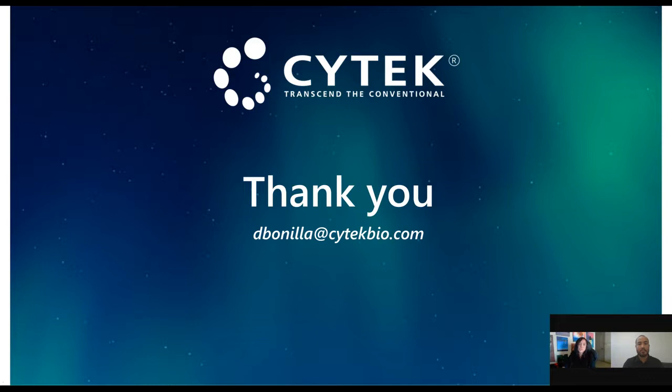For most of the cells, especially if you have big cells, granular cells, it's going to be useful. But we have seen cases in which that extraction led to less resolution. So ideally, you can create two experiments, without extraction and with extraction, and compare. Look at the resolution, look at your populations, and from the biological point of view, see if the results make sense.